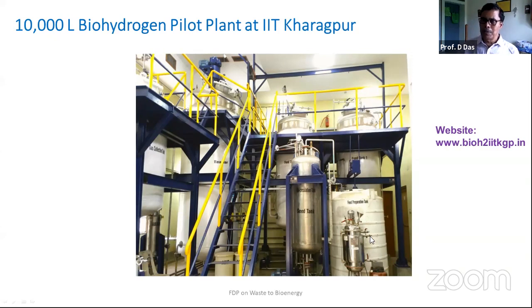And from 5 liters, we inoculate this in the 50 liters, we inoculate in the 500 liters. These 500 liters, we inoculate, we make it 4,500 liters. And there we 500 liters of inoculum we added. When rate of hydrogen production is maximum, they make up to 10,000 liters. This is how we operate.